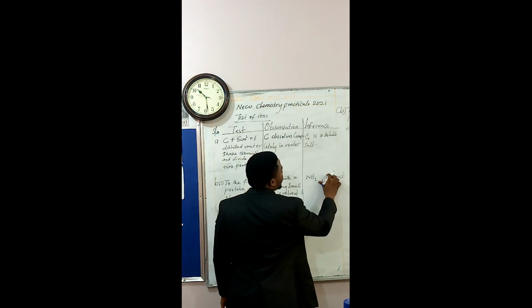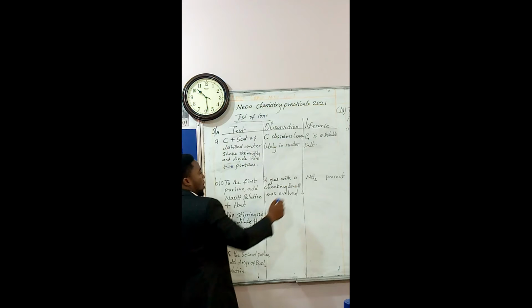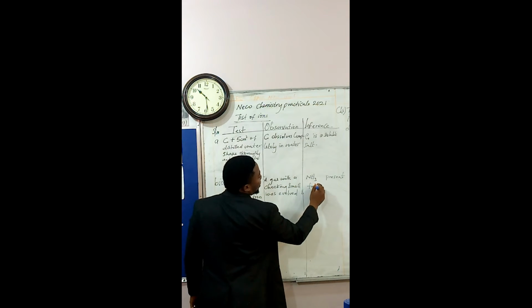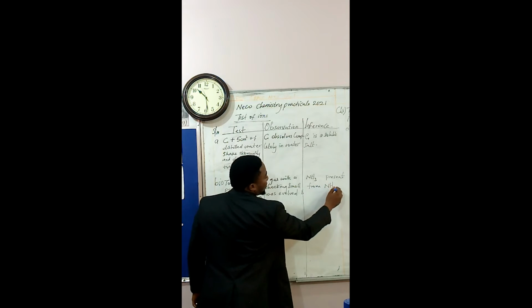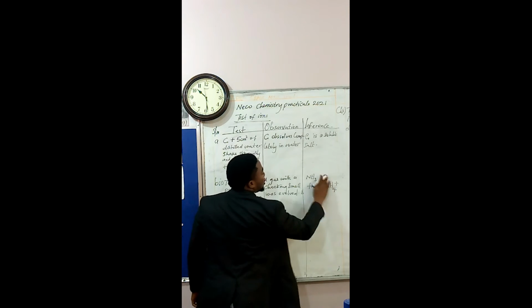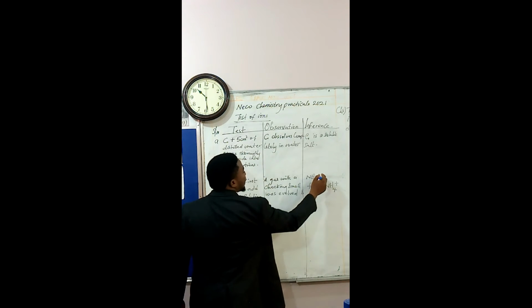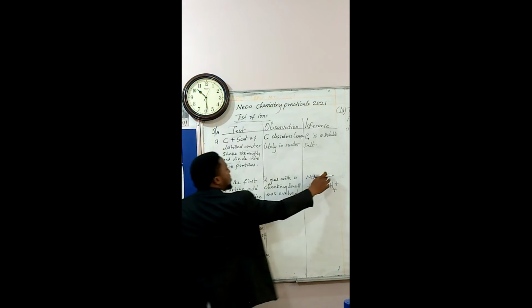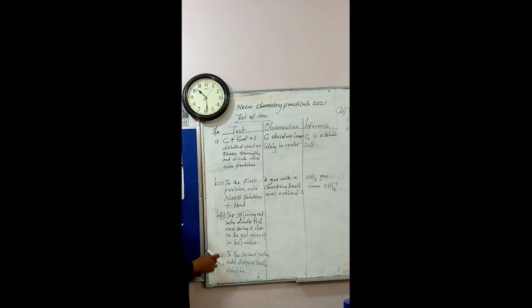Ammonia gas present. Alright, or you can say ammonia gas from ammonium ion. It's better to put it this way, ammonia gas from ammonium ion.